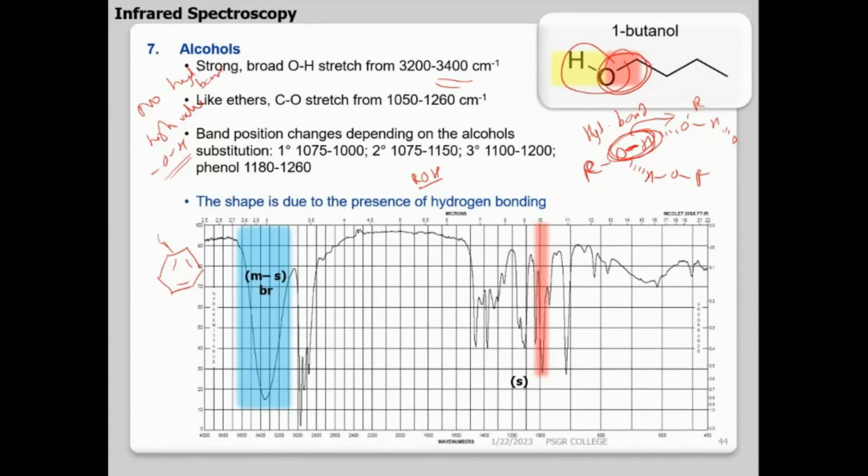So ஒரு gaseous phaseல நான் IR record பண்ணா என்னால ஒரு high value பார்க்க முடியும். But என்னால gaseous phase recording பண்ண முடியாது. அப்ப நான் என்ன பண்ணலாம்? I will dissolve this alcohol in a non-polar, that is non-protic solvent. ஒரு hydrocarbon solventல dissolve பண்ணிக்கிறேன், hexane, benzeneல dissolve பண்ணிடுறேன். Dissolve பண்ண என்ன ஆயிரும், ஒரு highly dilute solution. சரியா? So highly dilute solutionல dissolve பண்ணா ஒரு alcohol இங்க இருக்கும், இன்னொரு alcohol இங்க இருக்கும், இன்னொரு alcohol இங்க இருக்கும். புரியுதாப்பா எல்லாருக்குமே? Could you understand this concept? Yes, ma'am.